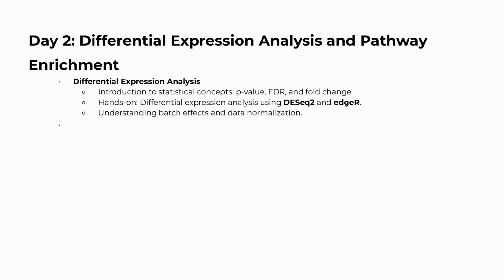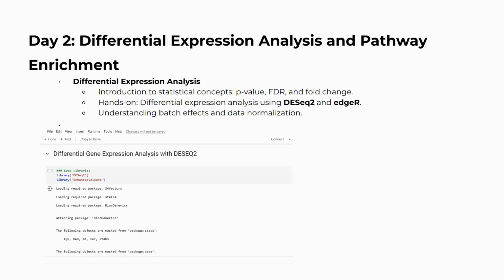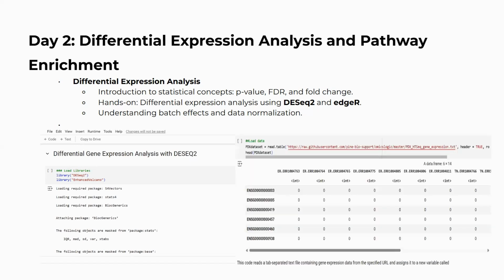For day two, we are going to delve deeper into differential expression analysis and pathway enrichment. For differential expression analysis, we are going to talk about the DESeq2 package on Colab, and we are going to introduce some statistical concepts of p-value, FDR, and log-fold change.